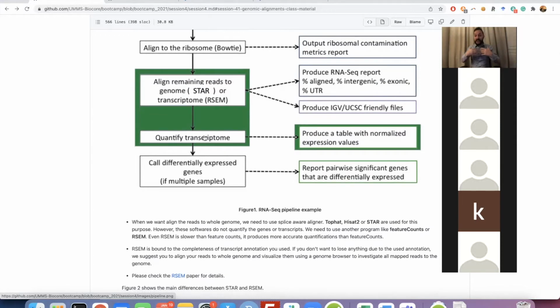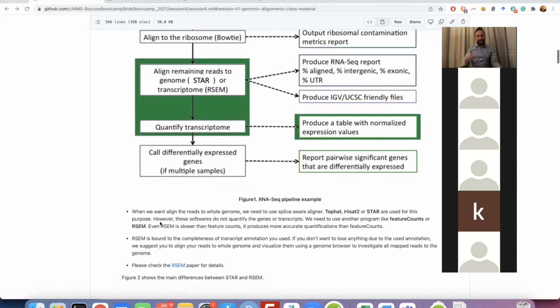I spent a lot of time myself, and all the other scientists also, after I prepared these BAM files, the alignment files, spending days and nights to see if everything is how they expected. Also, are there some other anomalies in the data, or some other interesting things? They were just browsing many of the genes, spending day and night just to see something interesting, because you are doing these experiments and you want to check that everything is fine. If it is RNA-seq, you expect uniformly distributed reads on your genes.